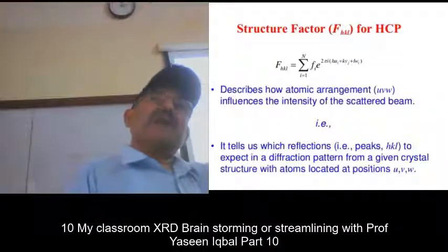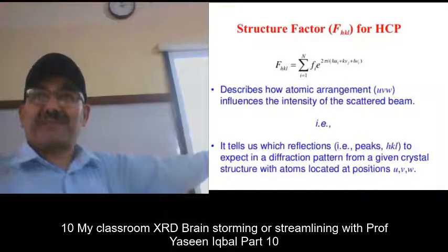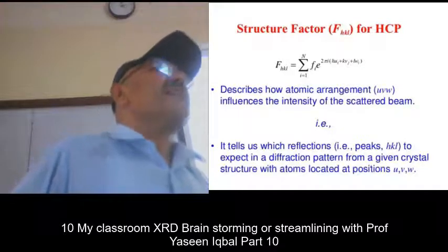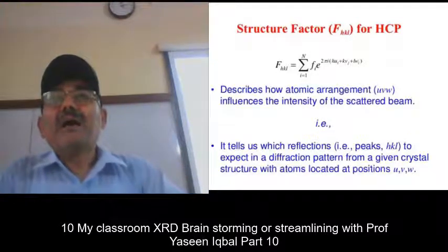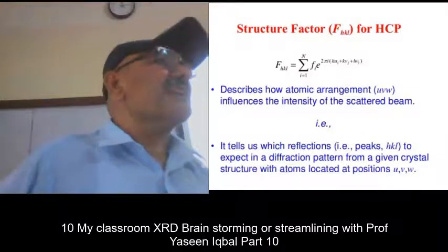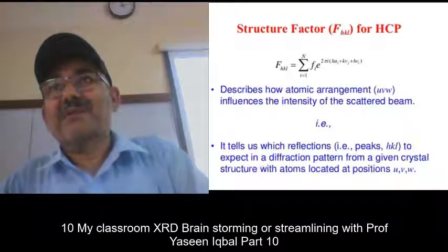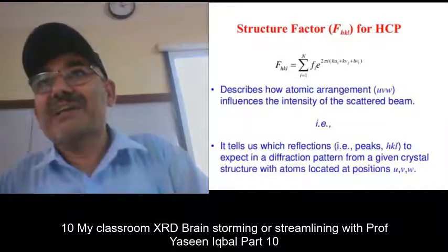Similarly, if it gives you a higher or lower value, then that affects the structure factor. So the structure factor is dictated by the HKL values. Listen to this carefully. For certain HKL values, it will give you 0 structure factor. When the structure factor is 0, it will not give you any intensity.